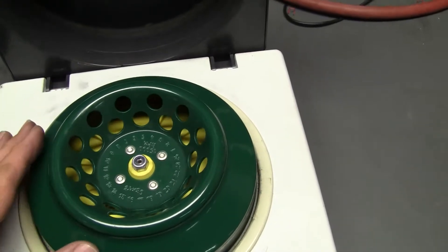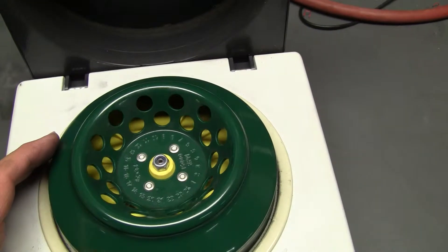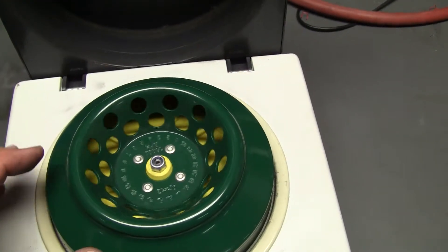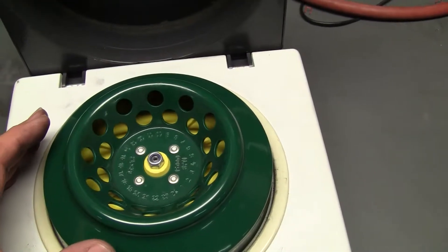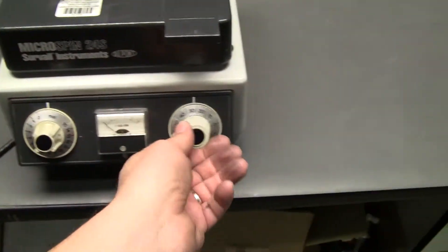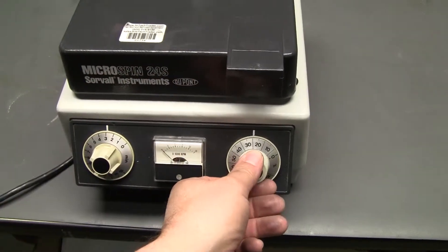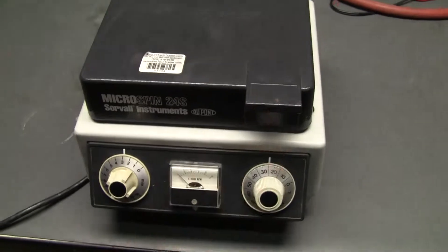Wonderful rotor. Looks to be 24 place. Locks down. You can set your speed here. Turning it on — there we go.